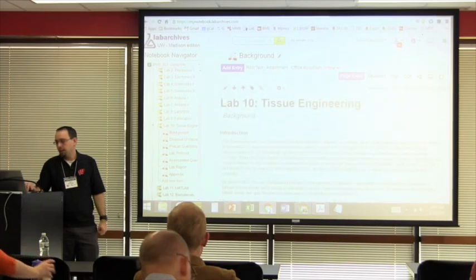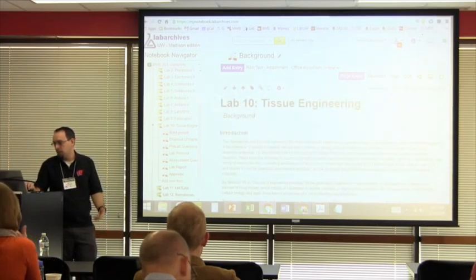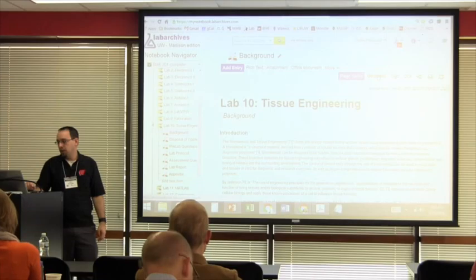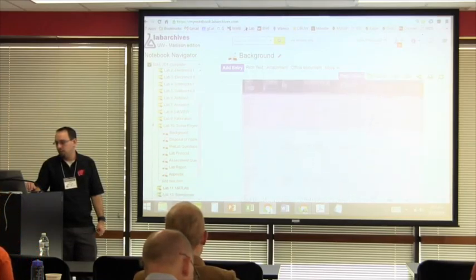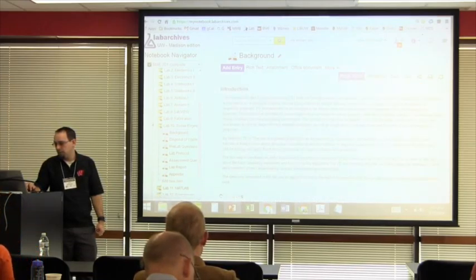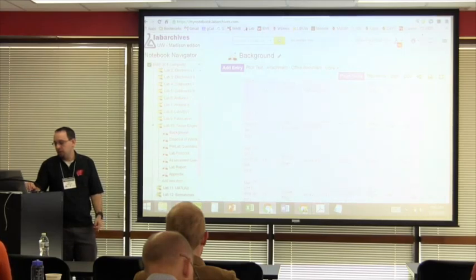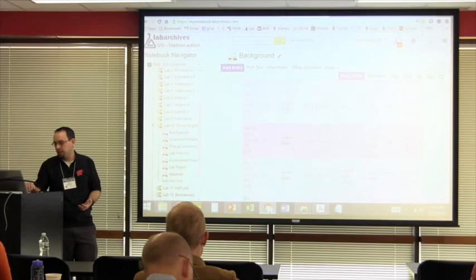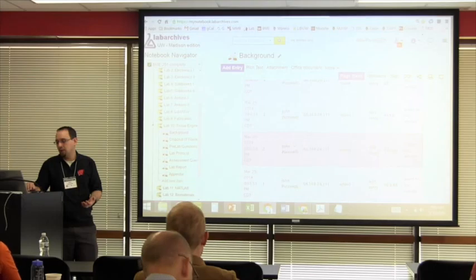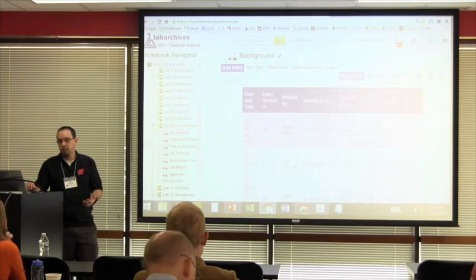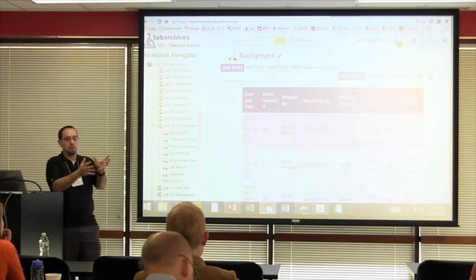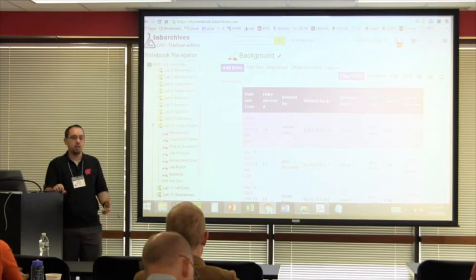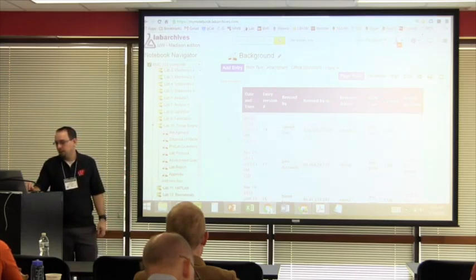Over here you can see who the last edit is. My TA made some edits over the last summer. We can go in and see all the different revisions that have been made on it. What's interesting is you can see that we had our TA, myself, and a student assistant that made some changes to this document. Depending upon which lab you look at, you can see how the contributions have come together to create almost like an e-text — we kind of think of this as an electronic textbook.